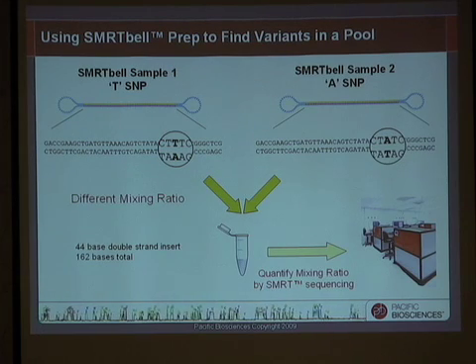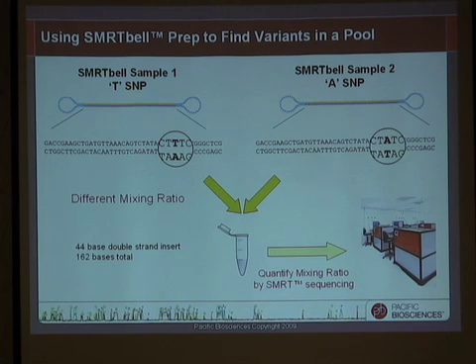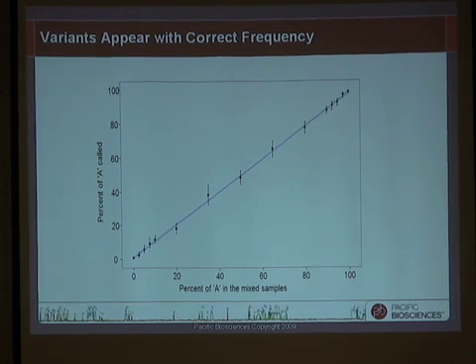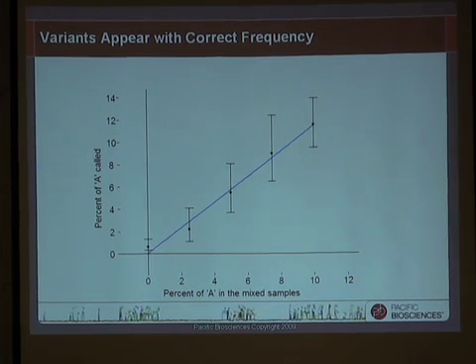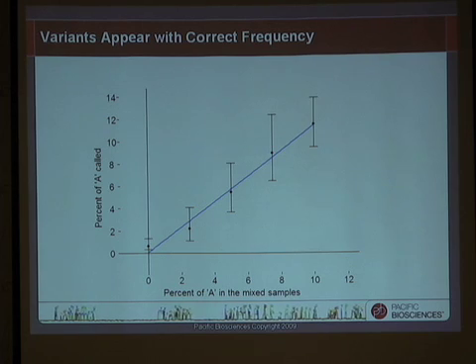We've used that to examine our ability to find variance within the pool. We built two SMRTbell DNA constructs that were the same, except for just one base, mixed them together in different ratios, and applied them to our sequencer. And we were very gratified to see, as we expected, because of the low bias we saw in the E. coli coverage, that there is also very little bias here. If you put in 50-50, you get about 50% of those dual alleles back. If you put in 80-20, similarly, you get 80-20 back. And I'll zoom in on this lower end here, where we're approaching down here to 0. These data suggest that even with today's system, which is a far cry from the system that we'll be shipping later next year, we can detect a 1% minor variant inside the pool, which is close to, I think, the best that you can do with any other technology.